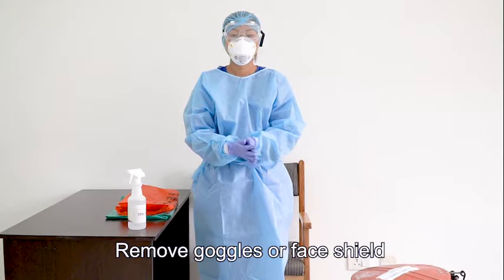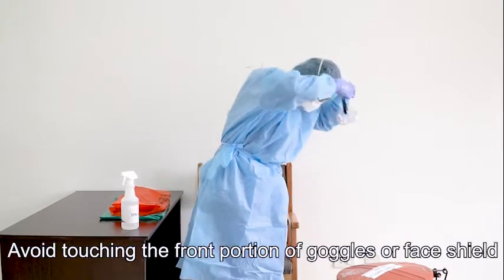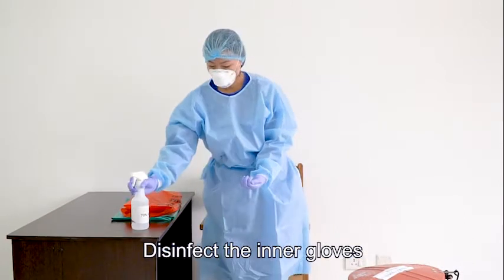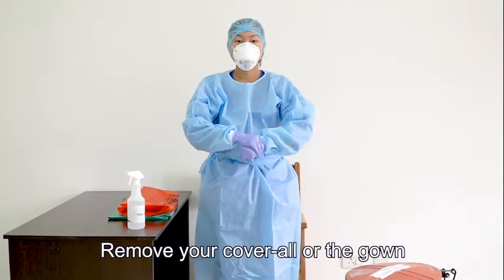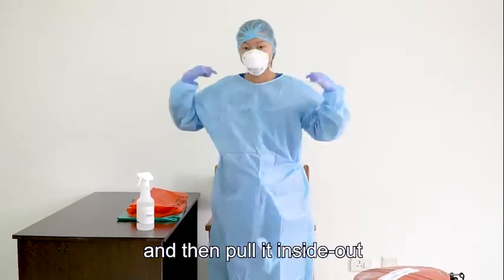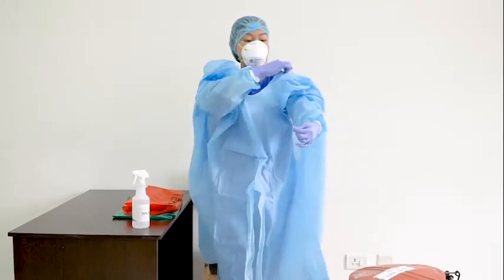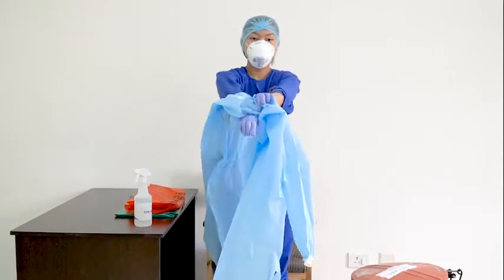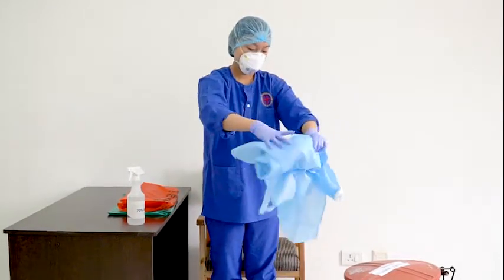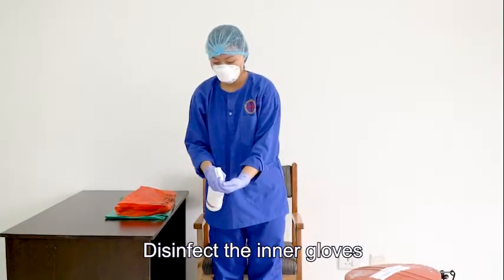Remove goggles or face shield by lifting back strap over your head. Avoid touching the front portion of goggles or face shield. Disinfect the inner gloves. Remove your coverall or the gown. Untie the knot first and pull it inside out by pulling the sleeves. Discard the gown in the Biohazard bag. Disinfect the inner gloves.